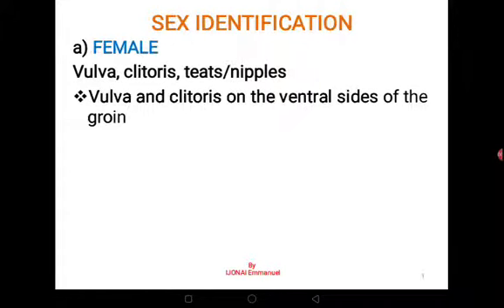Welcome to lesson three. We are still looking at the anatomy of the rat, and in this particular lesson we are going to do one major thing: sex identification. How do you tell that this rat is female or male?